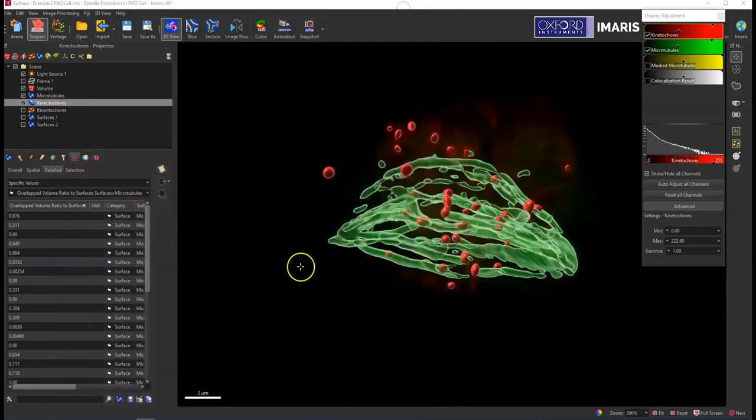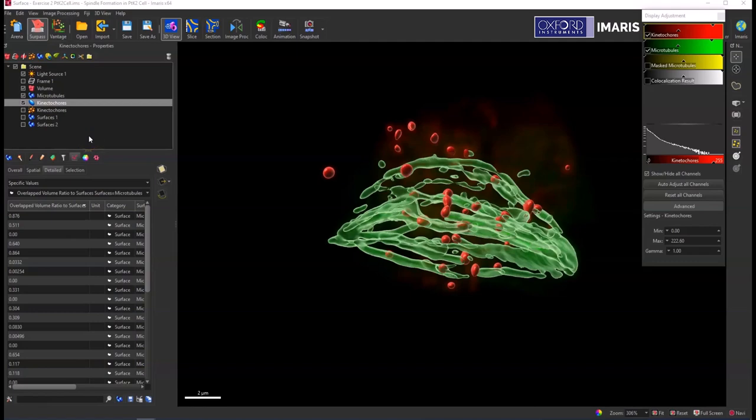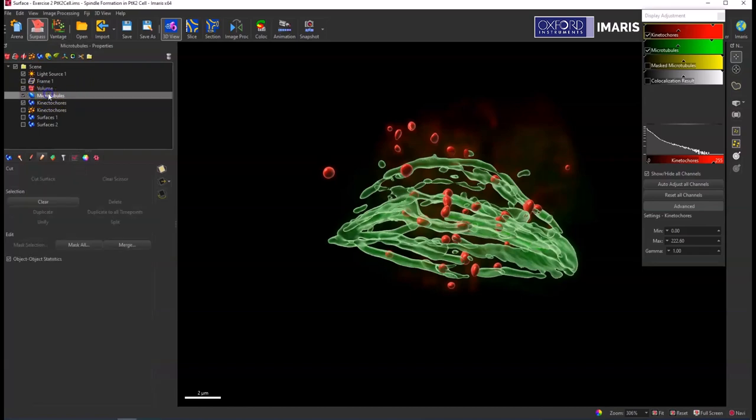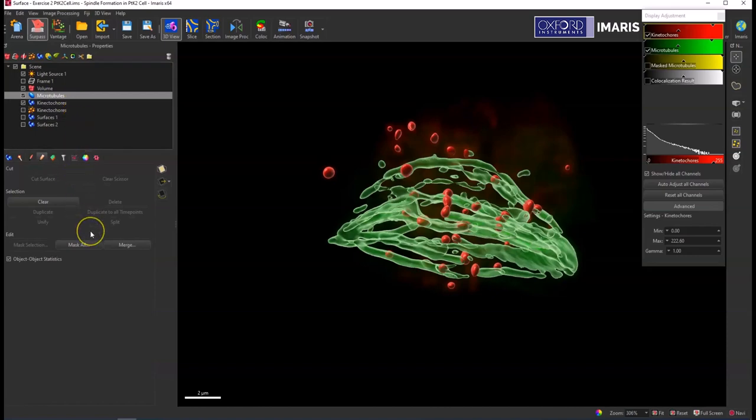And so that's how you can generate these statistics, but we also have another option to use a mask channel. So for this one I'm going to go to the microtubules surface, and you can do this the opposite way too, it just depends on what you want your resulting channel to be.